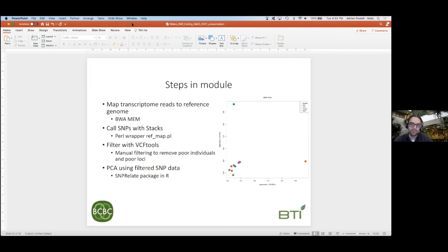But what's nice about VCFtools is that if you're running it on a server, it doesn't usually take too long to run. And you can try different runs and different versions and see how it's behaving. Sometimes it's nice to plot how many SNPs you have after each filtering step and see how it's treating your VCF file, your SNPs.